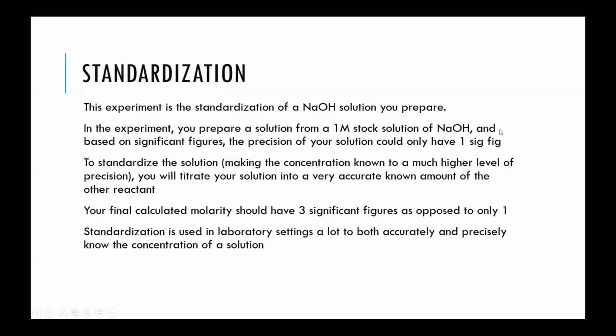But when you standardize this through the chemical reaction, you're using more precise volumes and more precise measurements of the other component. And then through the chemistry, you can get an exact concentration out to a higher level of significance.